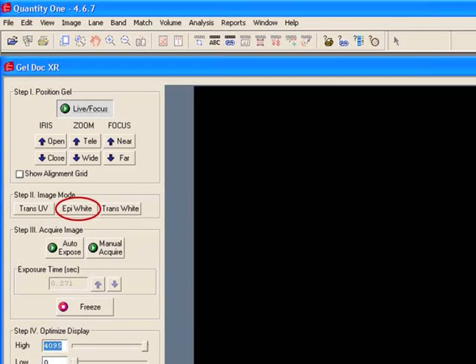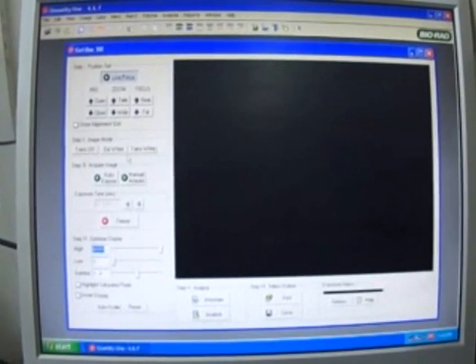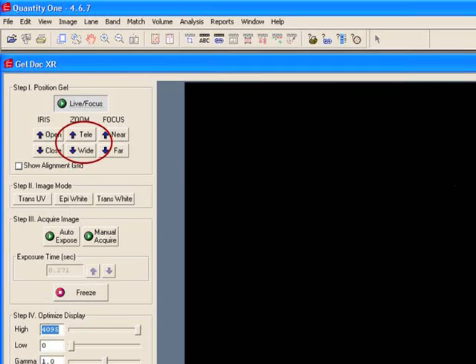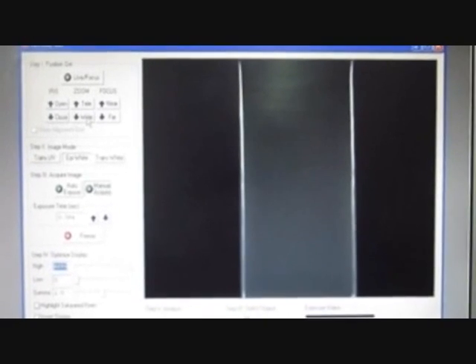Select epiwhite from the illumination type options to switch on the visible light. Using the tele and wide option, the gel can be zoomed in or zoomed out so that the entire gel is seen on the screen.